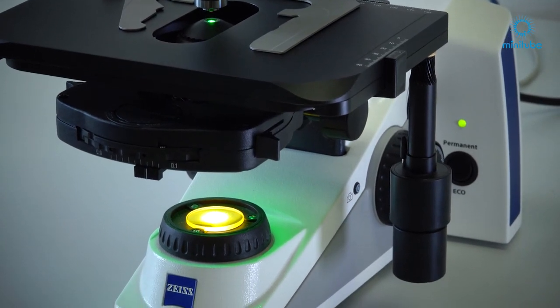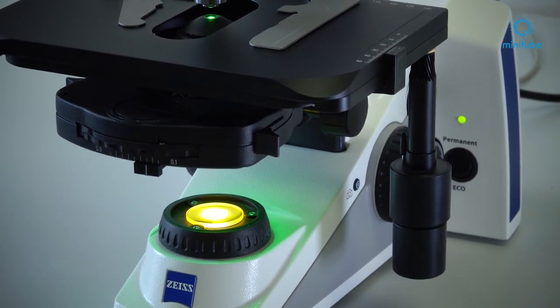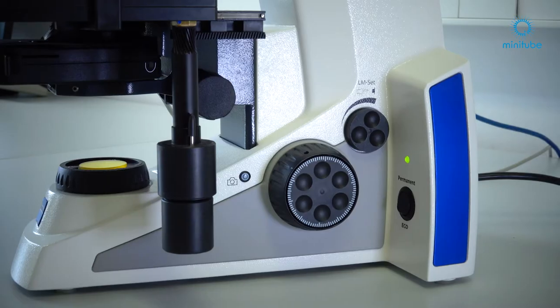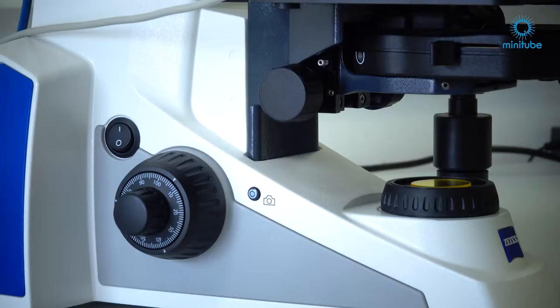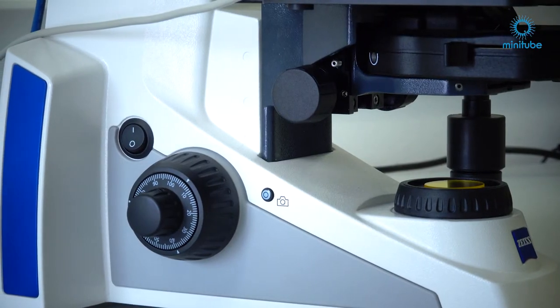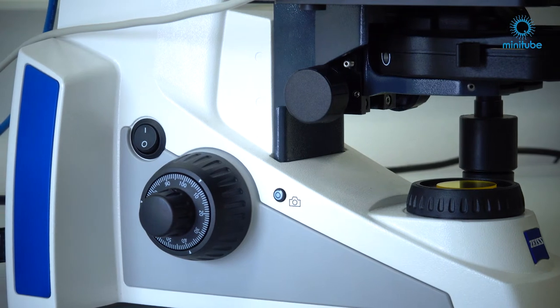The condenser with aperture diaphragm and the field diaphragm. Here you can see the knob for light intensity and the focusing drive for fine and coarse adjustments on both sides of the microscope and the main switch.